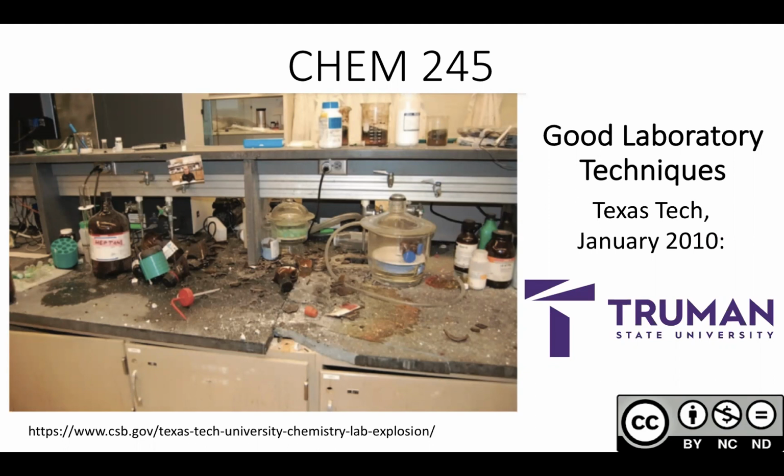And while trying to purify the compound, one of the students was using a mortar and pestle and managed to pretty much blow off his hand. So again, there's a lot of things that usually need to go wrong for you to essentially get in trouble. So today's going to be walking through a lot of the individual things that you can fall back on to help minimize the likelihood that you're going to get in trouble. And that when you do, there's always a good fallback to minimize the amount of damage that might happen.